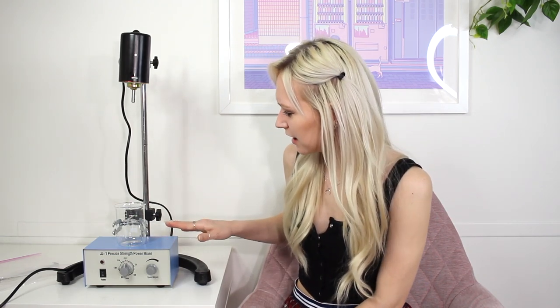Was it worth 60 bucks? Totally — I love it. Maybe one day when I have tons of money I'll purchase a $200 or $300 one. I don't know how much longer this one is going to last me — like I said, it seems like it's been used and may be on its last leg. I'll keep you updated and let you know if it ends up breaking.